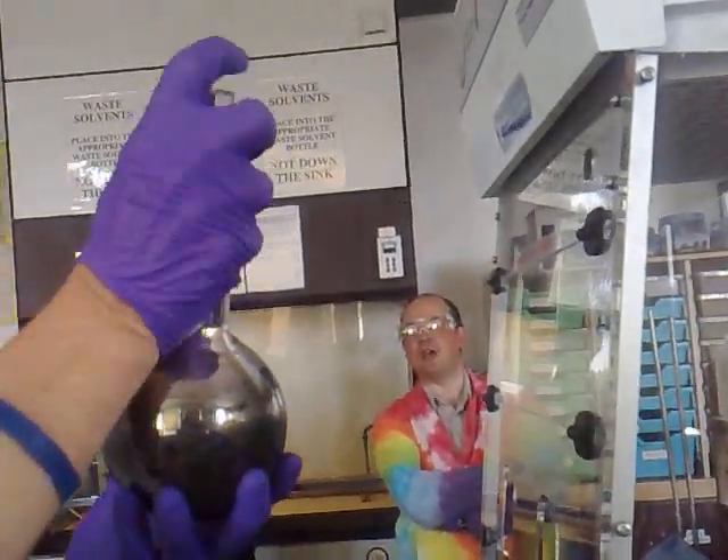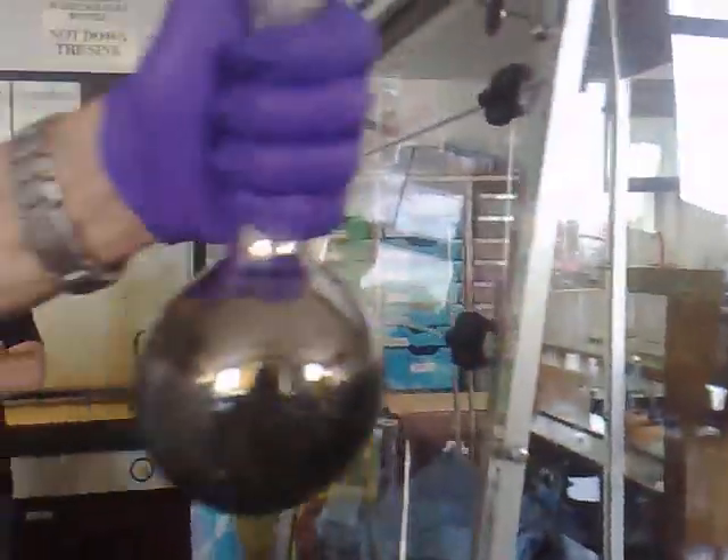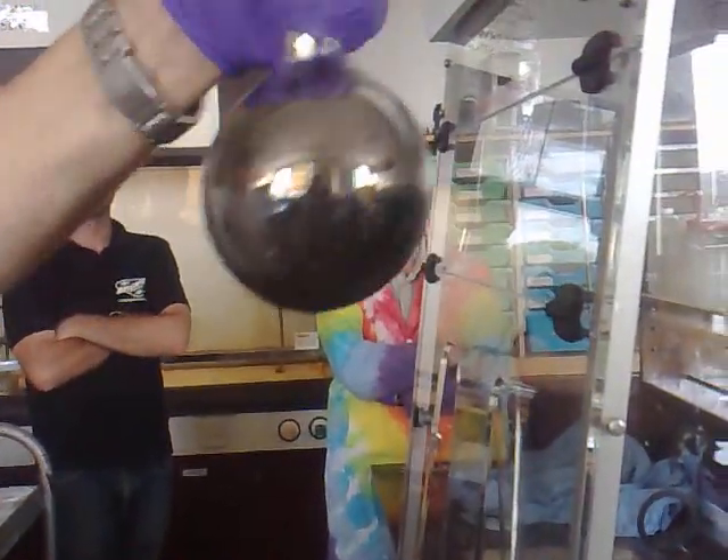Was this reaction ever actually used to make mirrors? I don't think so. They're expensive mirrors, aren't they? I think it was — was it? I think it was, yeah. Asked and answered.